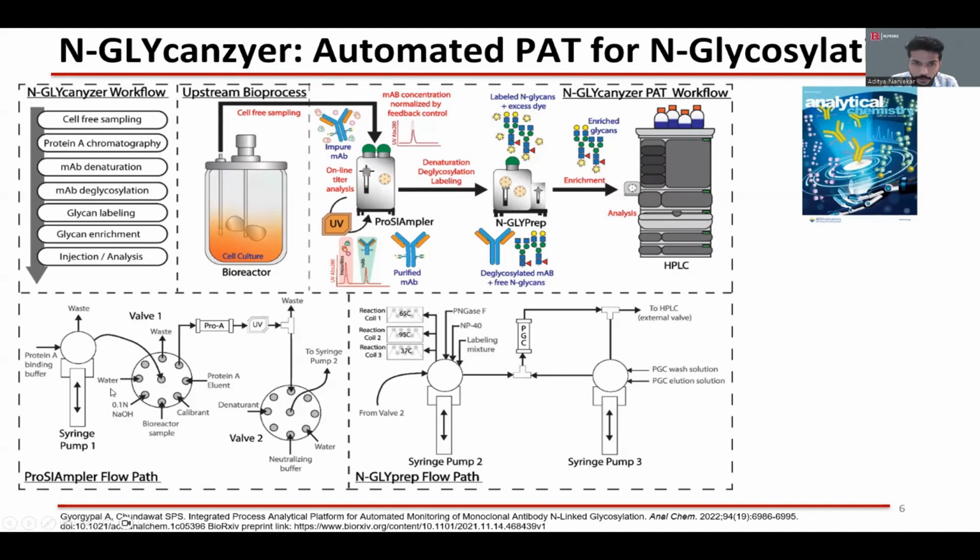And the same workflow is shown in the form of a pictorial representation by means of a flow injection device demonstration, which is actually the workflow that takes place in the lab on an instrument involving these valves and pumps, which ensure that different buffers, sample, and elution buffers are going through different ports of the valves and mixing at the right time based on the command from the Python code in the software.